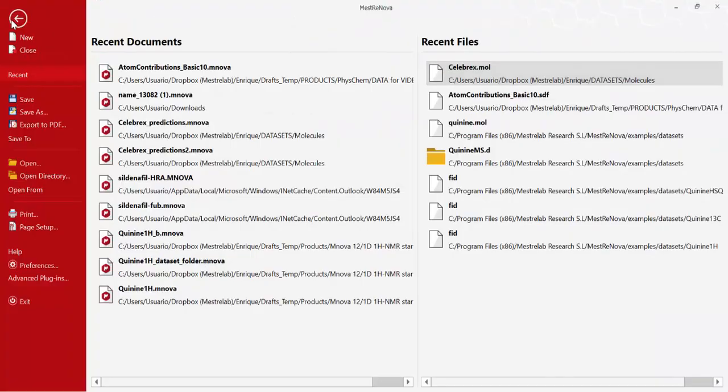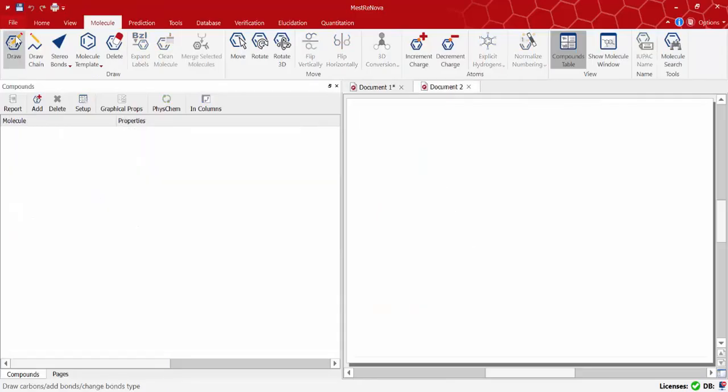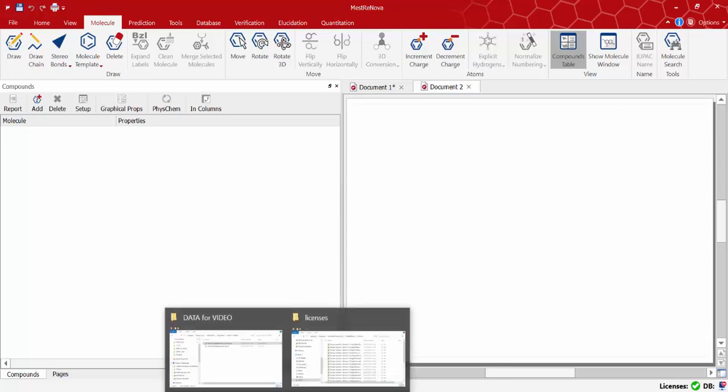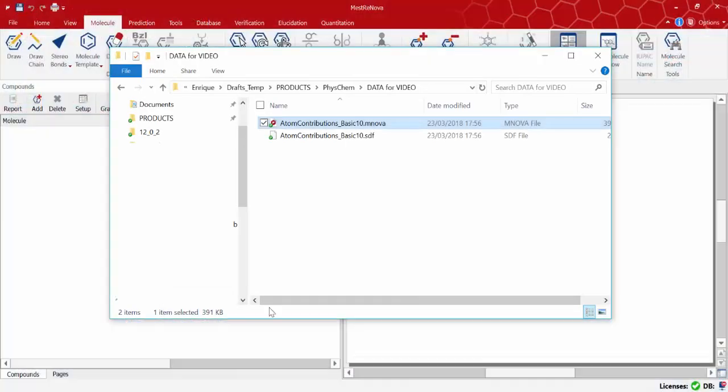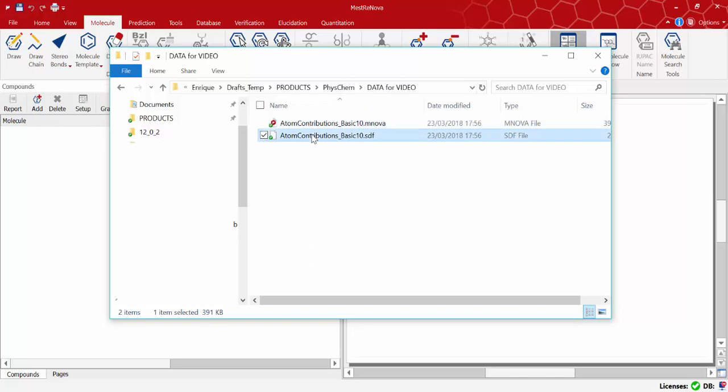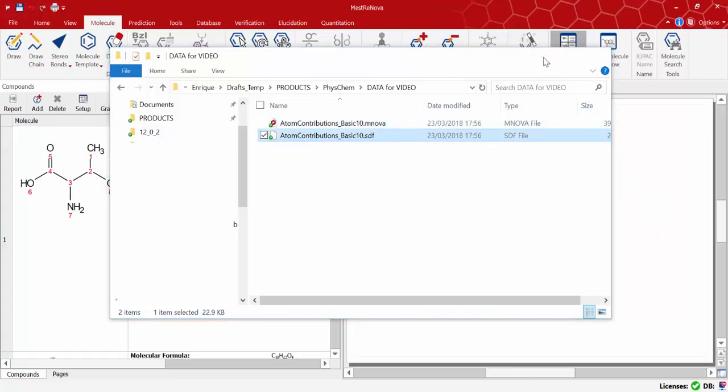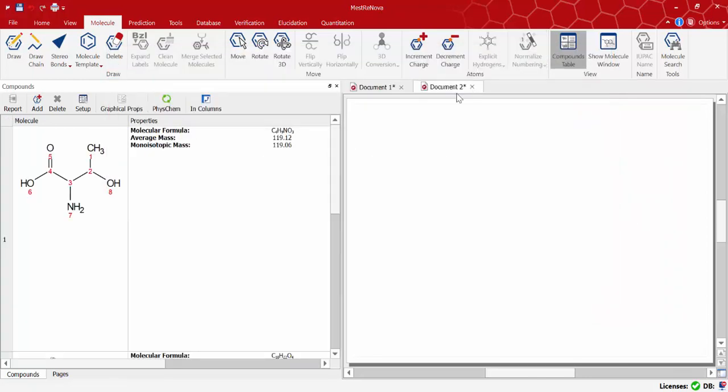The MNOVA PhysChem module can also load a batch of molecules by opening an SDF file. So open a new document in MNOVA and load the SDF file. In this case we've got 10 different molecules.